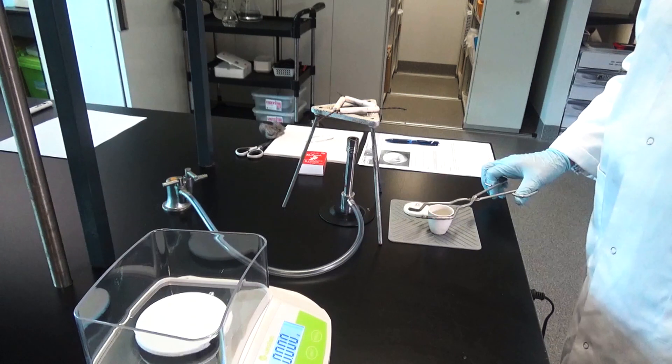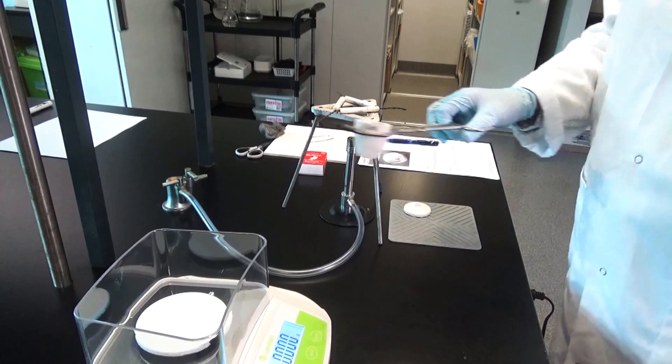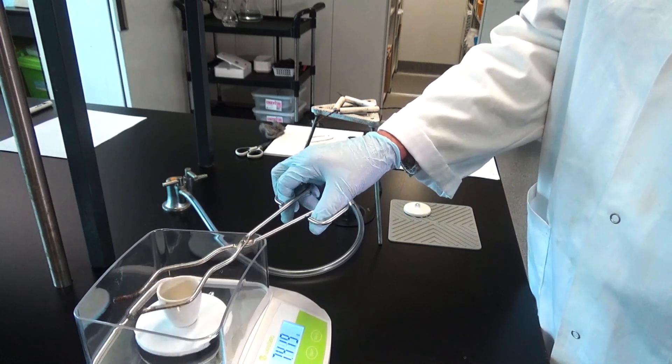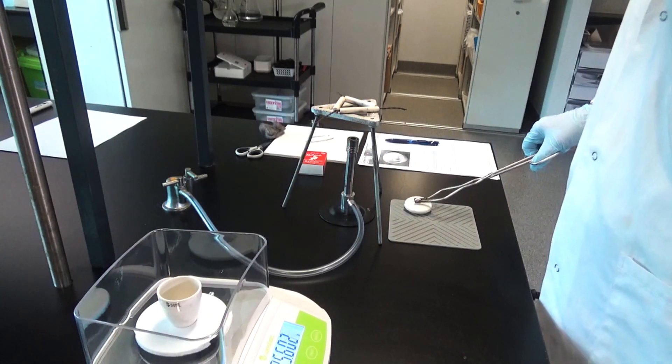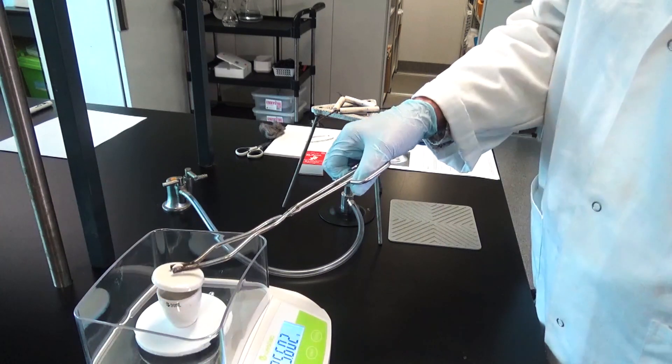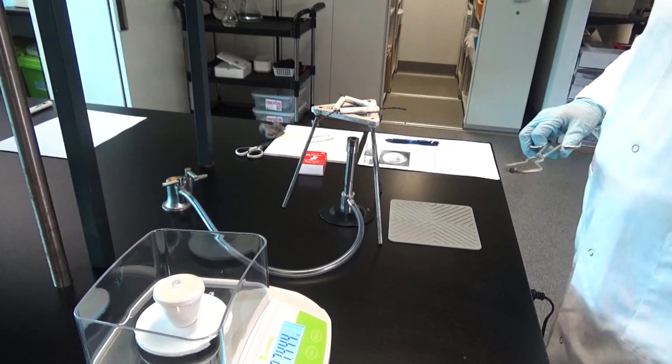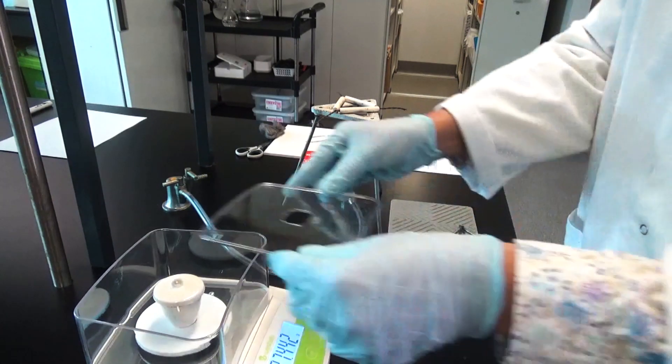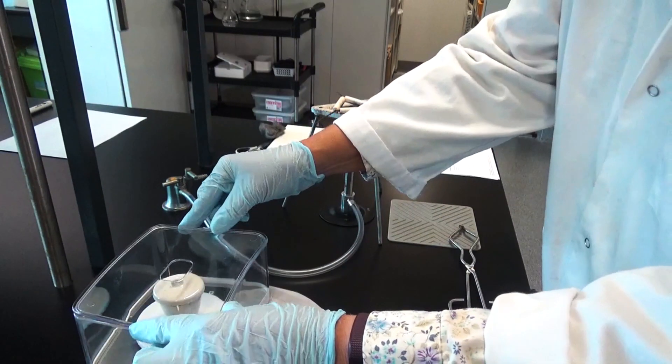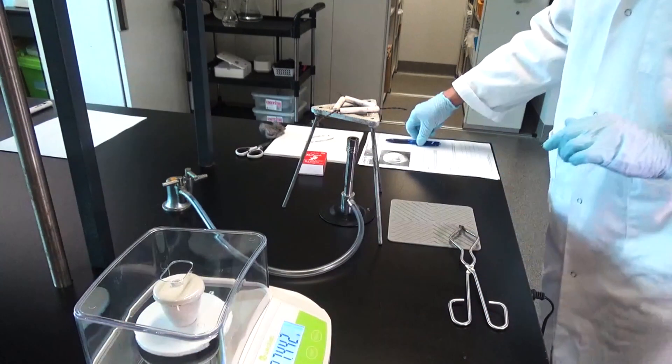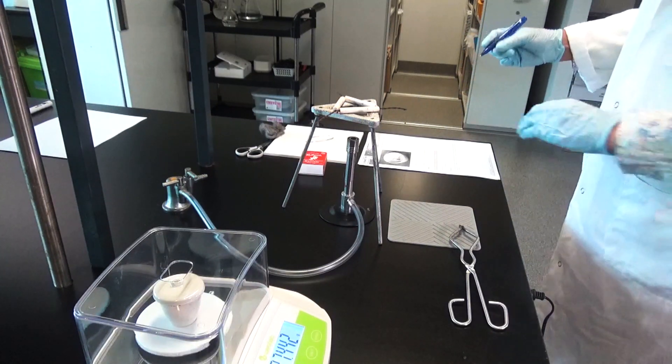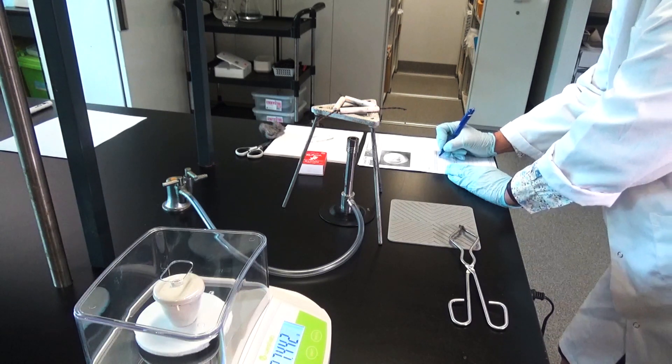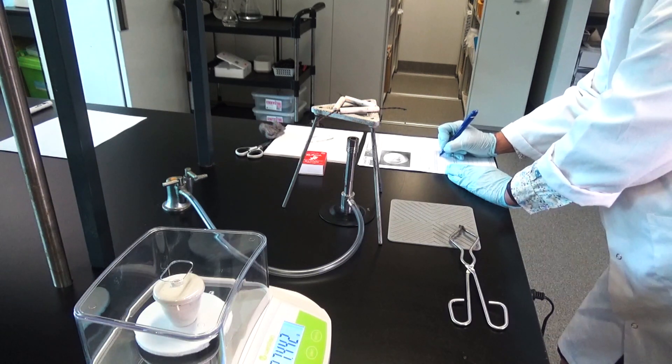Right, so now we're going to get the mass of the crucible. Our balance is set up to record to three decimal places. I'm going to have the lid as well in this crucible. I'll put this on so that we've got no air flow affecting the results. The crucible and the lid together is 37.442 grams.